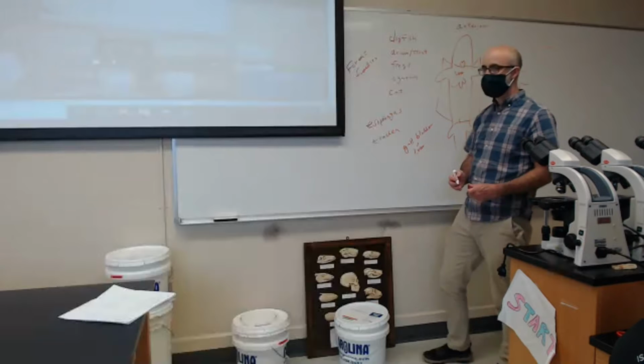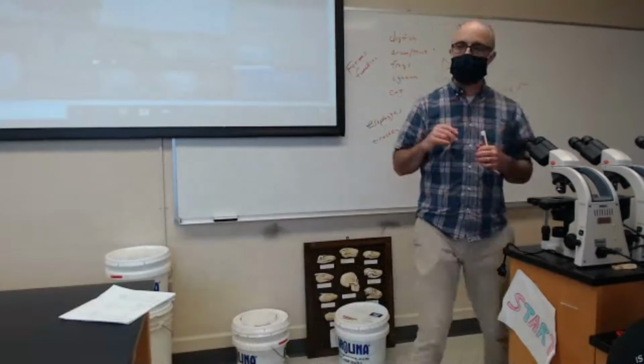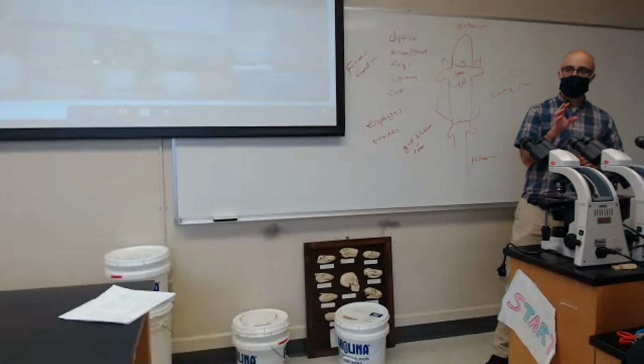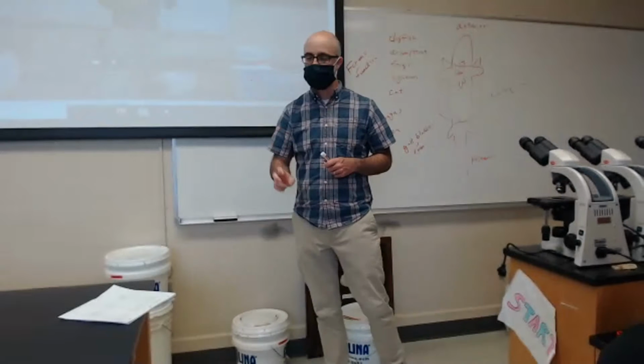Okay. So when you open up an animal, the first really easy landmark is the liver. Then poke around on the liver and you'll find the gallbladder. It's usually green colored. It's like a little bulb. It's not muscular. It's a little sac.